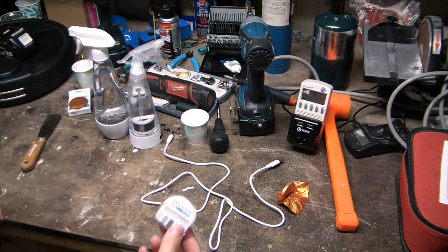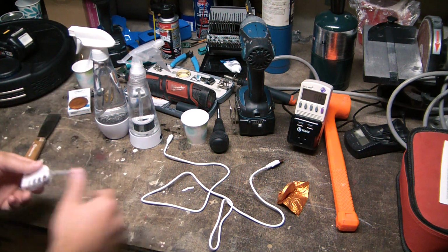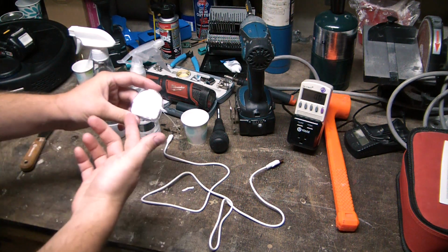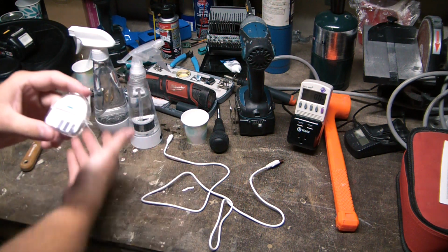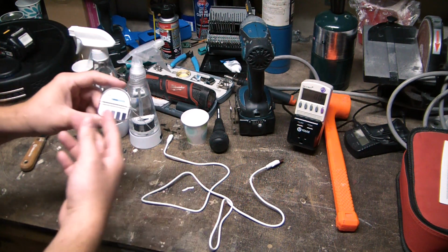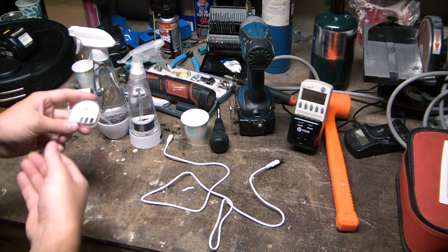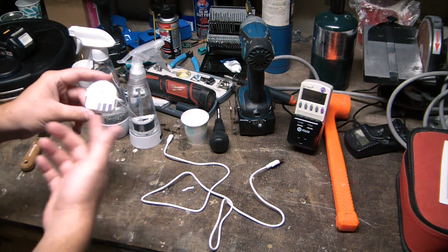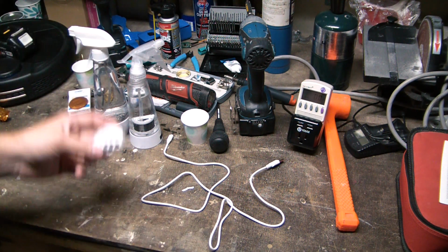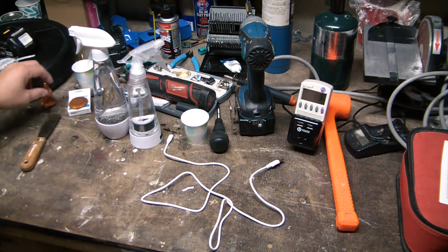So we'll recharge these with some salt, give each one a test to see where the chlorine concentration is. If it reads maxed out on the scale, what we can do is dilute the volume by half and then see if it comes back up on the scale. That way we can get a good idea. Then we'll just multiply it by the number of dilutions, and we'll know exactly where the concentration of hypochlorite actually is in the original solution.